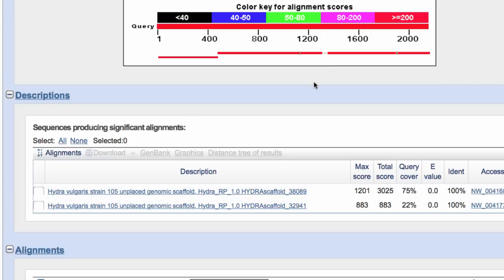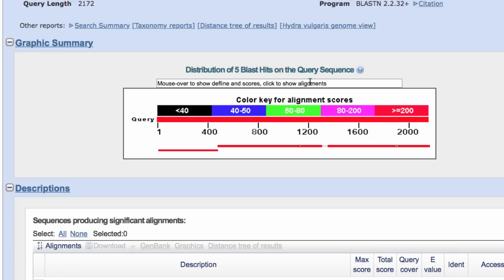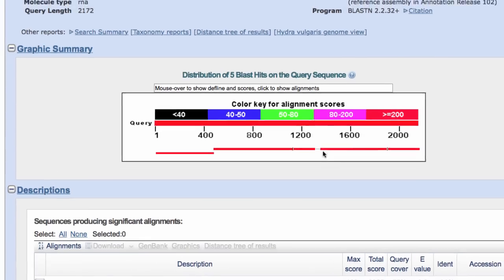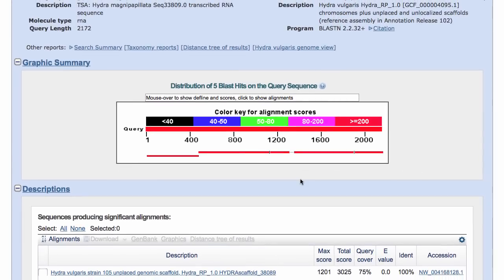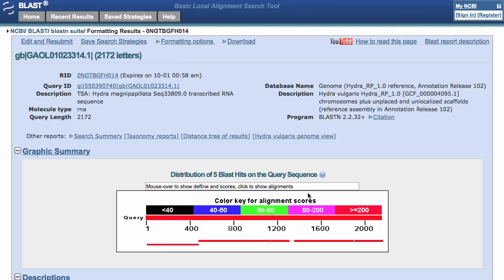Since the query here was an mRNA and we're searching genomic sequences, I assume these gaps are introns. To recap: I've found a genomic assembly for Hydra vulgaris from the BLAST home page and searched it.